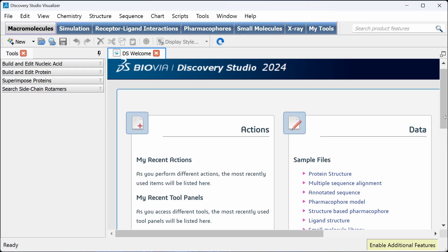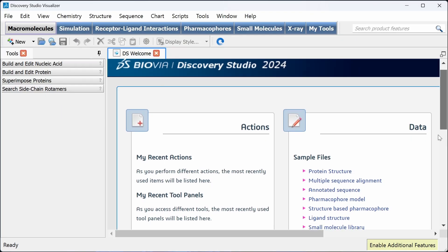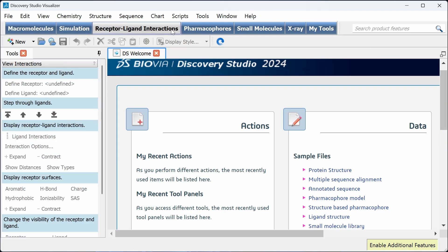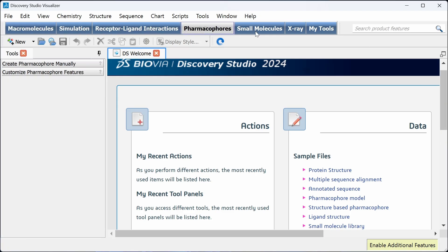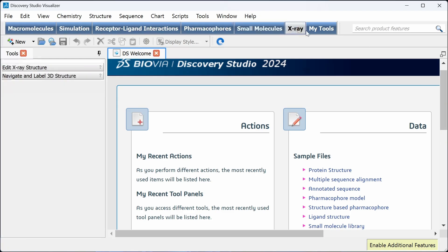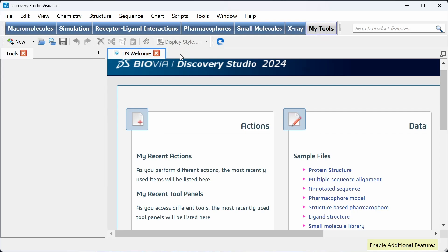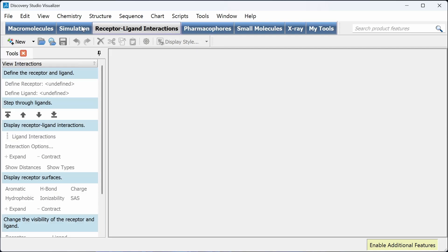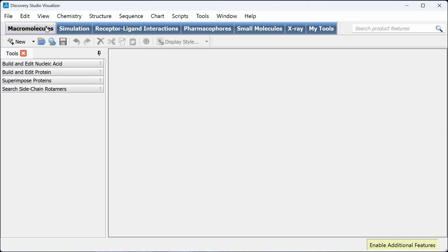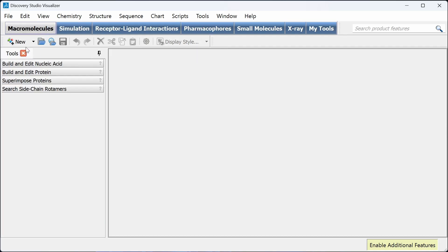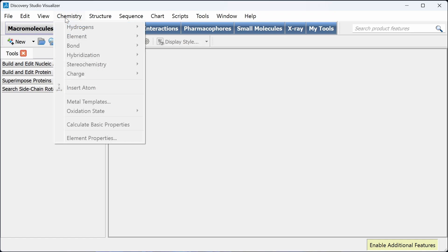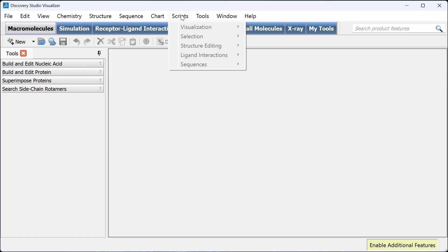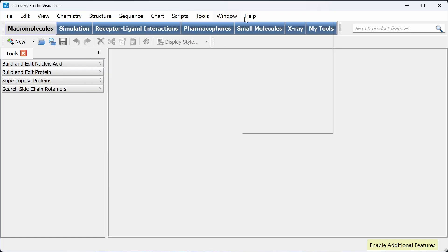This will optimize for your graphics card. You can see, this is the welcome page for Discovery Studio 2024. And these are all the tabs: macromolecules, simulation, receptor ligand interactions, pharmacophores, small molecules, x-ray, and my tools. And this is the toolbar.